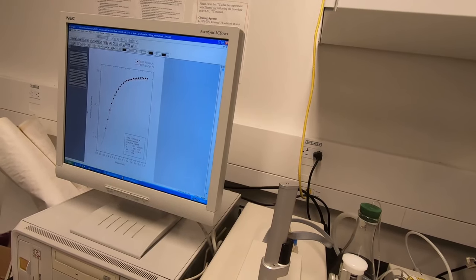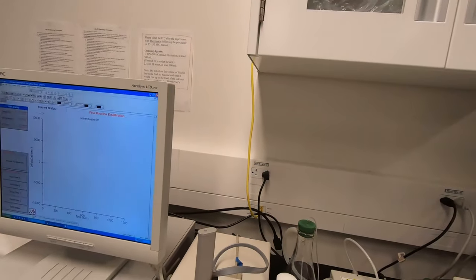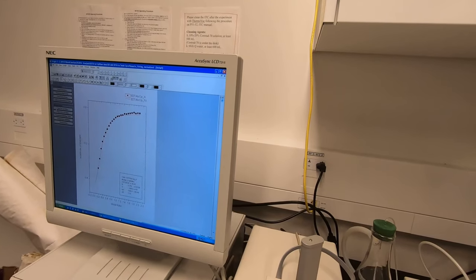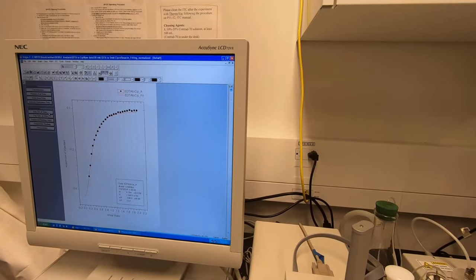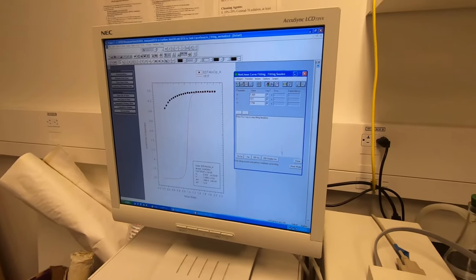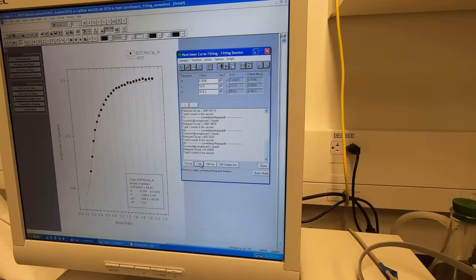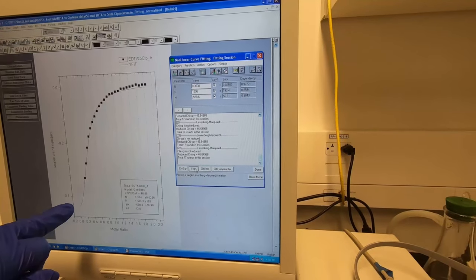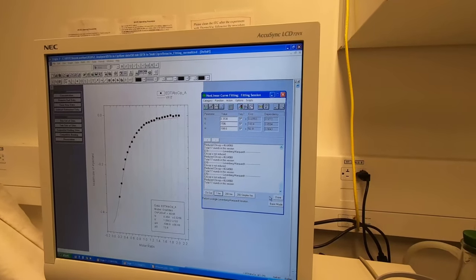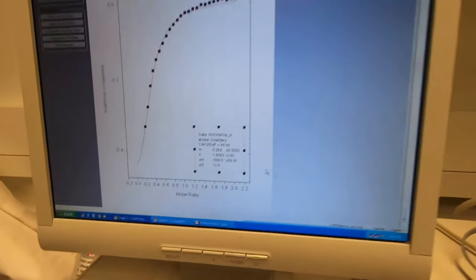For data analysis, you analyze this by fitting using the MicroCal LLC ITC software. In this case, I have already fit this data. You will automatically generate a titration curve here. Click the fit button — keep clicking until the parameters here do not change anymore. It will fit to your titration result and then give you the thermodynamic parameters you need.